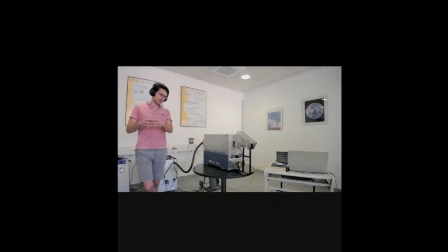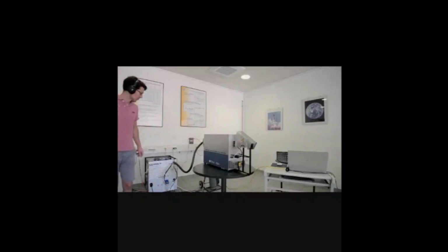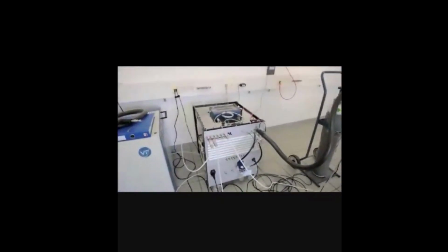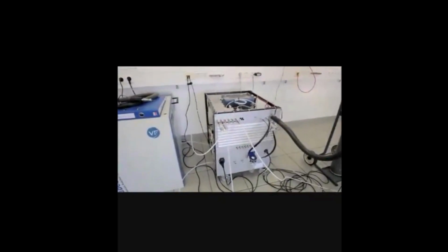First of all, we have compounds which contain sulfur that are pretty much unknown to us. After passing through the gas oxidizer, these will all be converted into SO2. Then they will enter the instrument, and there the analysis of the SO2 concentration will proceed. First of all, maybe I will pick up the camera and show you a little bit closer what is going on on the instrument, and how to set this all up. Let's see if I can set it up properly. Yeah, that looks good.